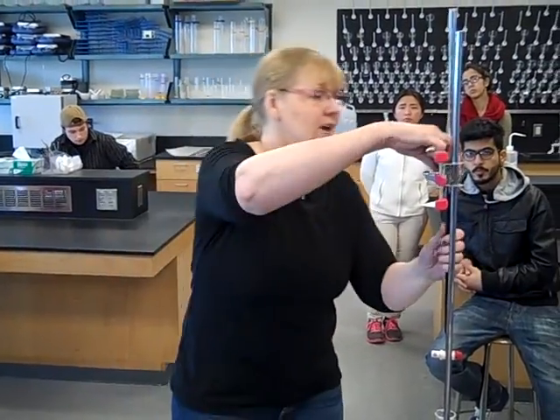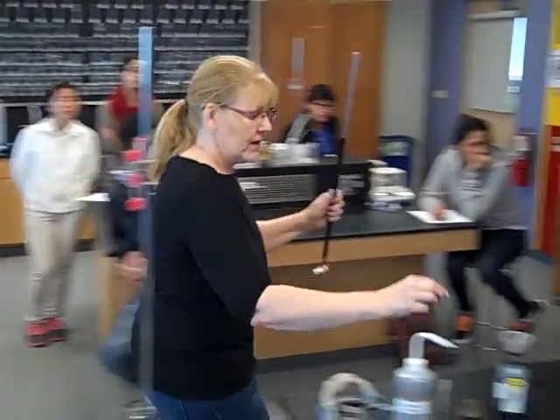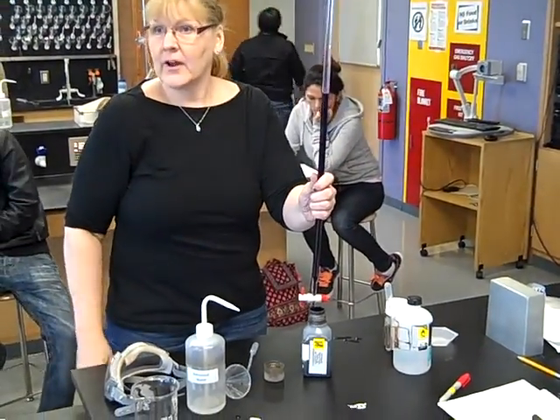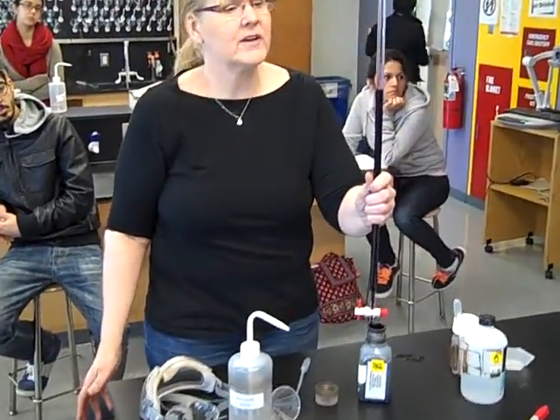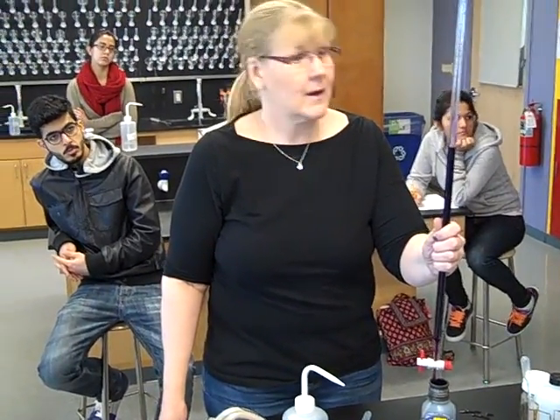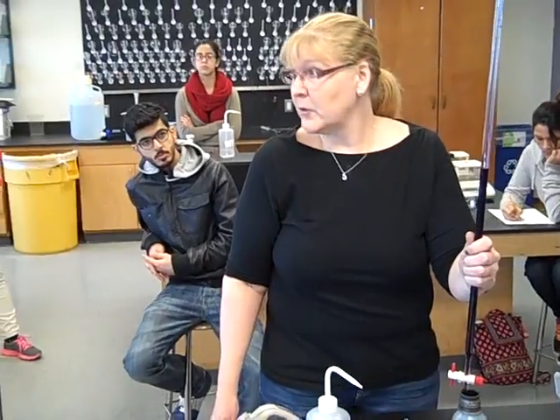When you're through with your titration, take your permanganate and pour it back into the container. We don't want this stuff down the sink and we're cheap. Put your goggles on and have fun.